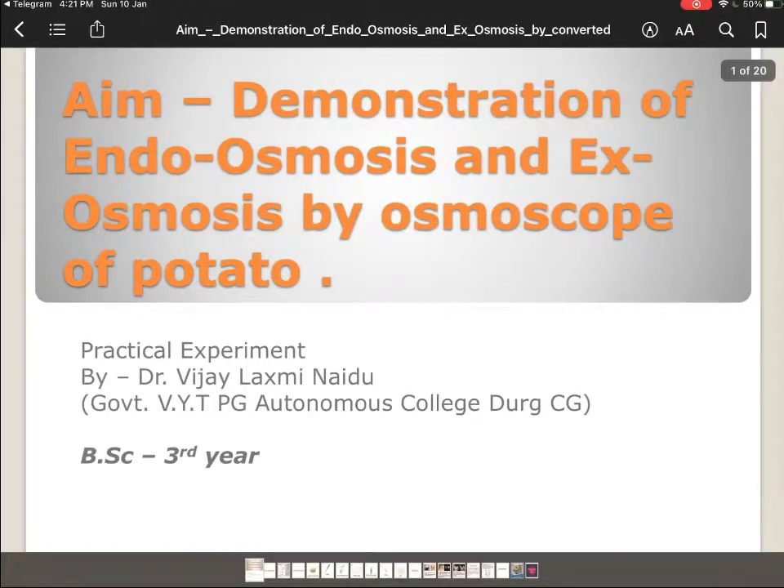Our today's practical experiment is a demonstration of endosmosis and exosmosis by the osmoscope of potato. This is Dr. Vijay Lakshmi Aidu from Government VYT PG Autonomous College, Durg. This practical is given in the syllabus of BSc 3rd year botany students.